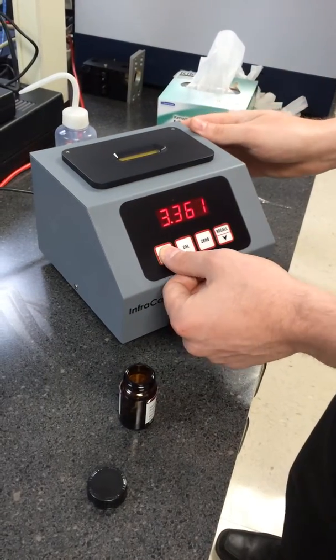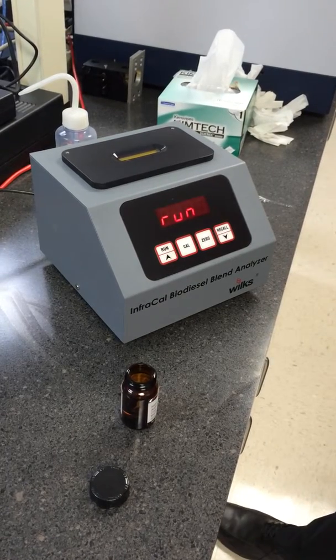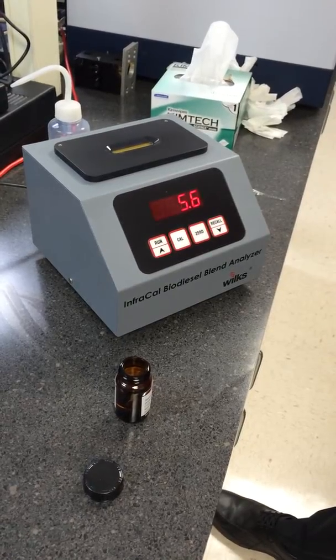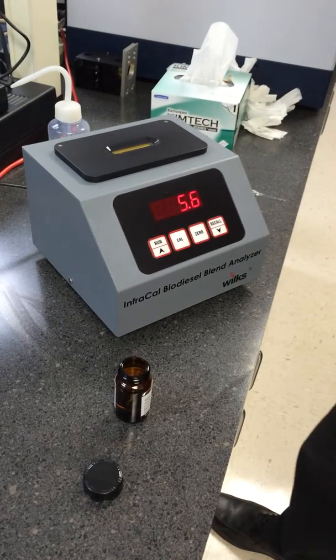Hit the run button. A number representing the concentration of the sample should appear on the screen.